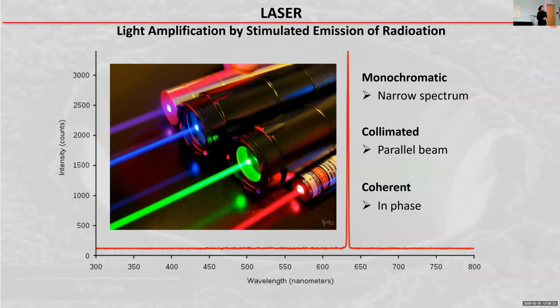So the laser, and I don't think I have to say that, unlike the laser ablation ICP-MS method, it's a very linear light.